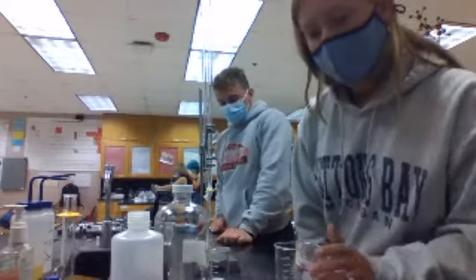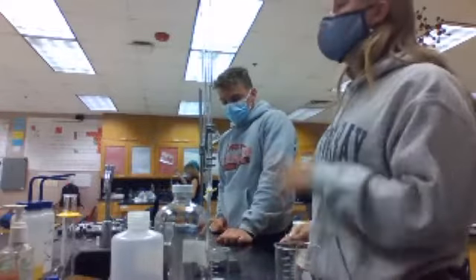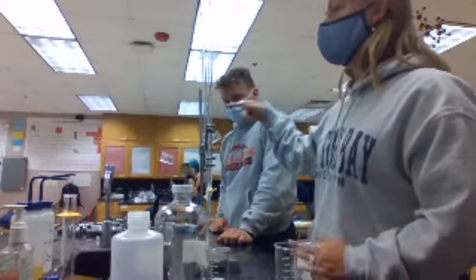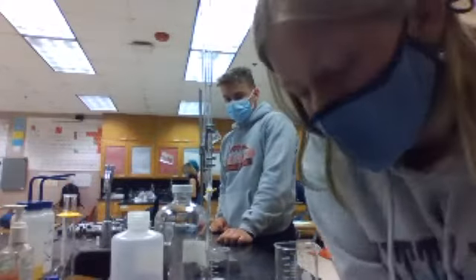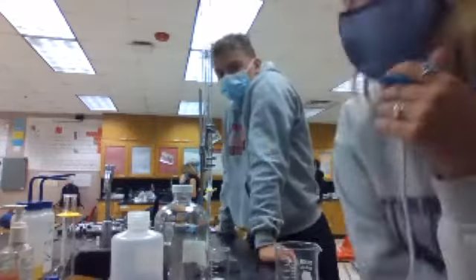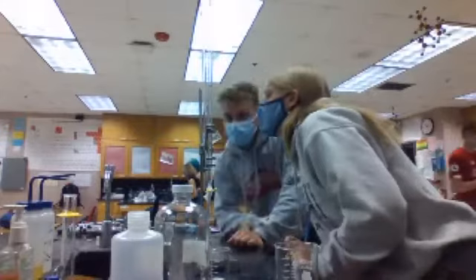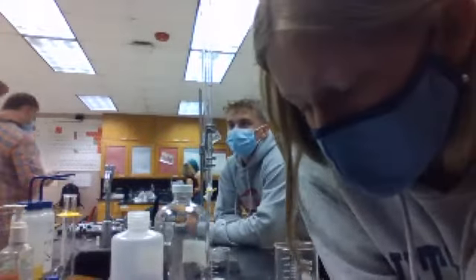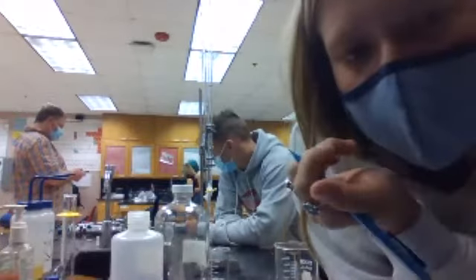Okay, so when we drain the 10 milliliters of the acid, is that the final volume, whatever we end up with? Okay. So for the final volume of the HCl, I just drained exactly 10 milliliters. Yeah, it's right on the 30. So the final volume of the acid is 30.00.